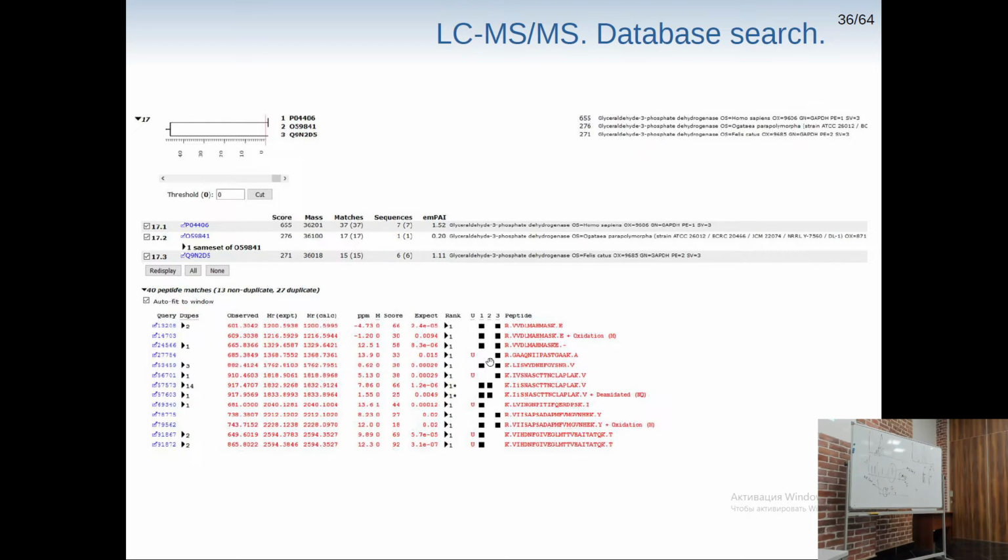I have a cat, my friend has a dog, and when we were preparing samples, it was obvious from the identification who was the author of the sample, except for the person who has no pets, because the protein that was identified is keratin from Pan troglodytes, from some ape. But it's just because the ape has first position in the database and human the second. So it's not that she actually has some ape in her house.